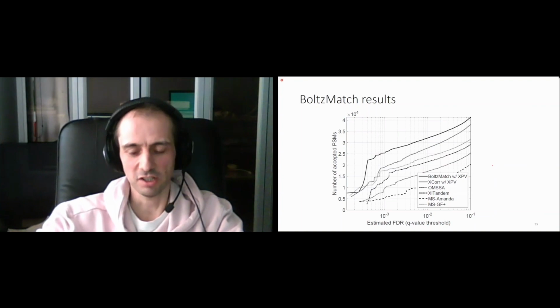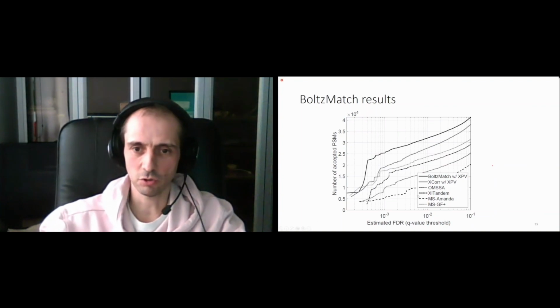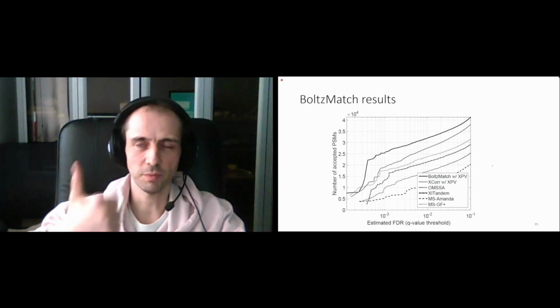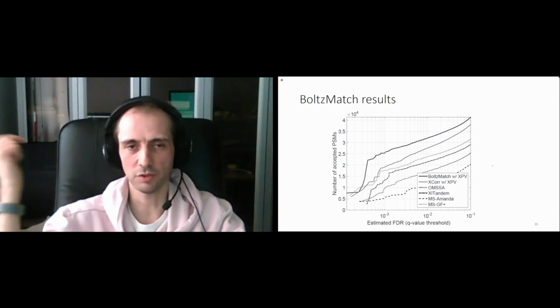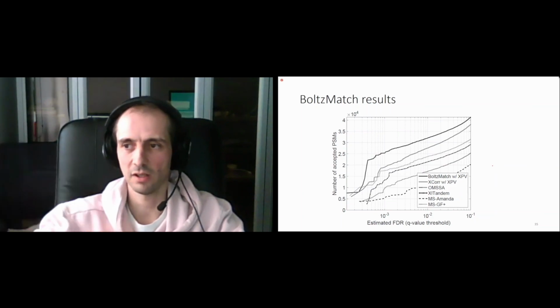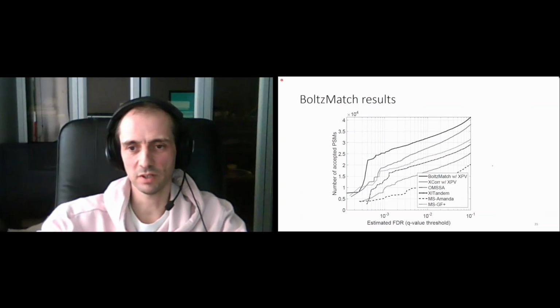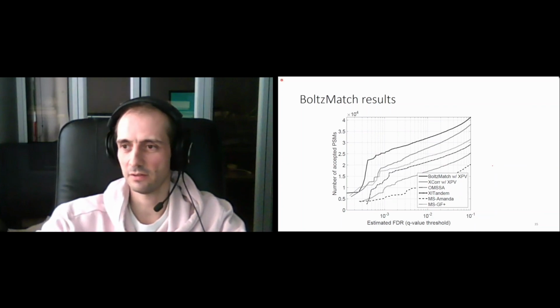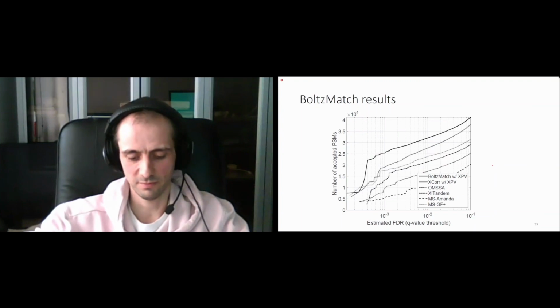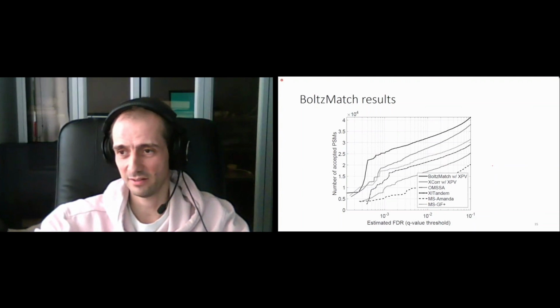Yeah. But actually, with this whole methodology, if you take any of these methods, they have usually around 100 parameters. Okay. You need to specify the taxon, you need to specify the modification, you need to specify the protein database, you need to specify everything. And if you make big mistakes, you can get like 0 results. Yeah. With the old methods too. Yeah, so you still need a really serious specialist to use them. Yes. Okay.